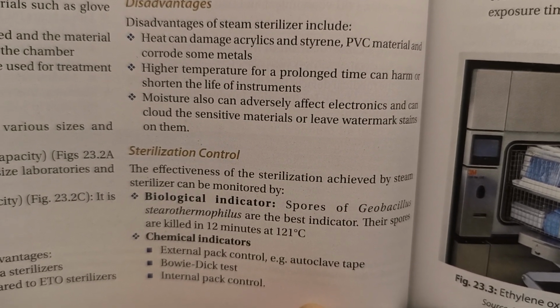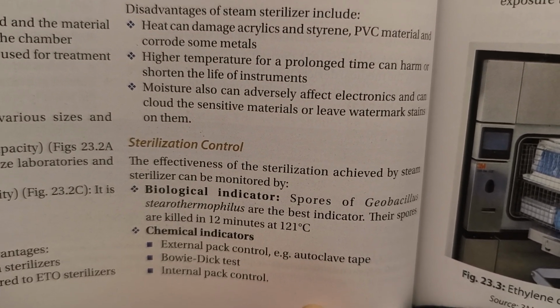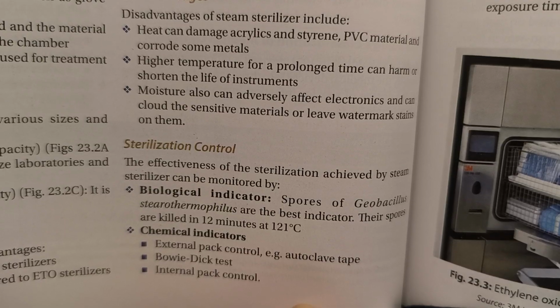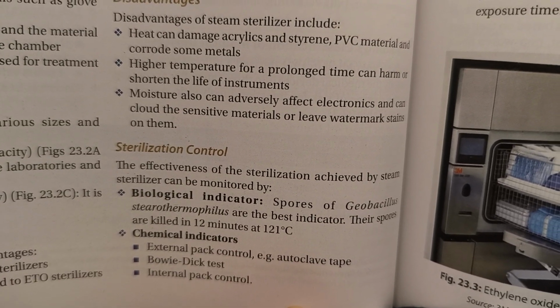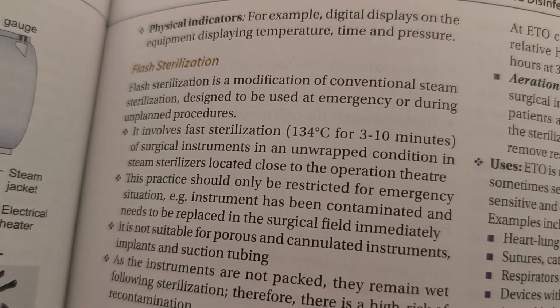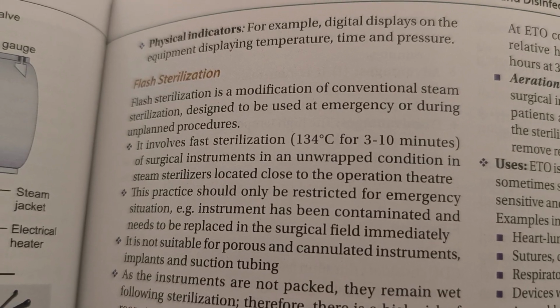Then we can consider that the sterilization process is effective. Chemical indicators include external package control, for example autoclave tape, Bowie-Dick test, and internal package control. Then physical indicators, for example digital displays on pressure equipment displaying the temperature, time and pressure.